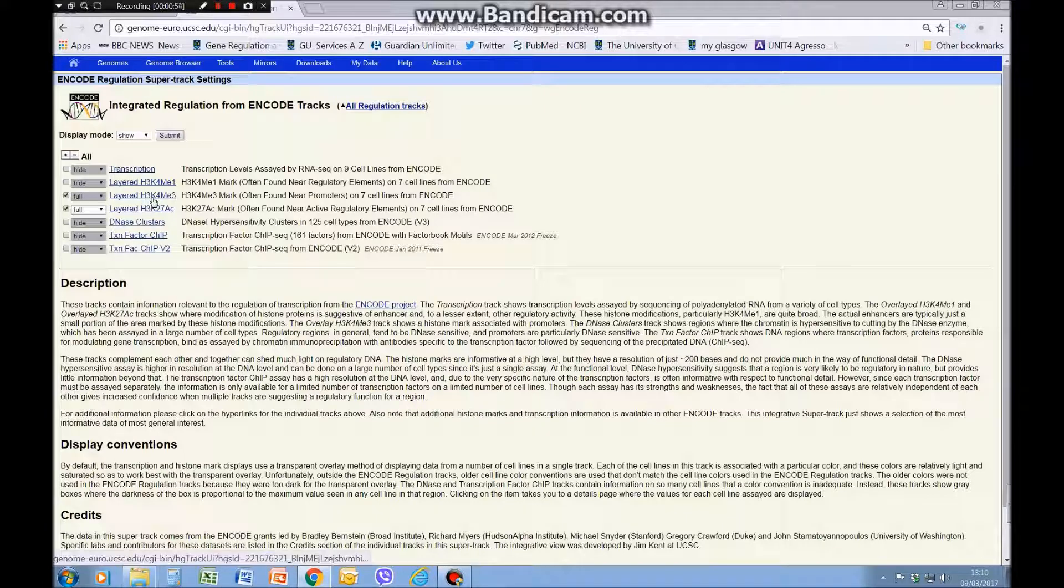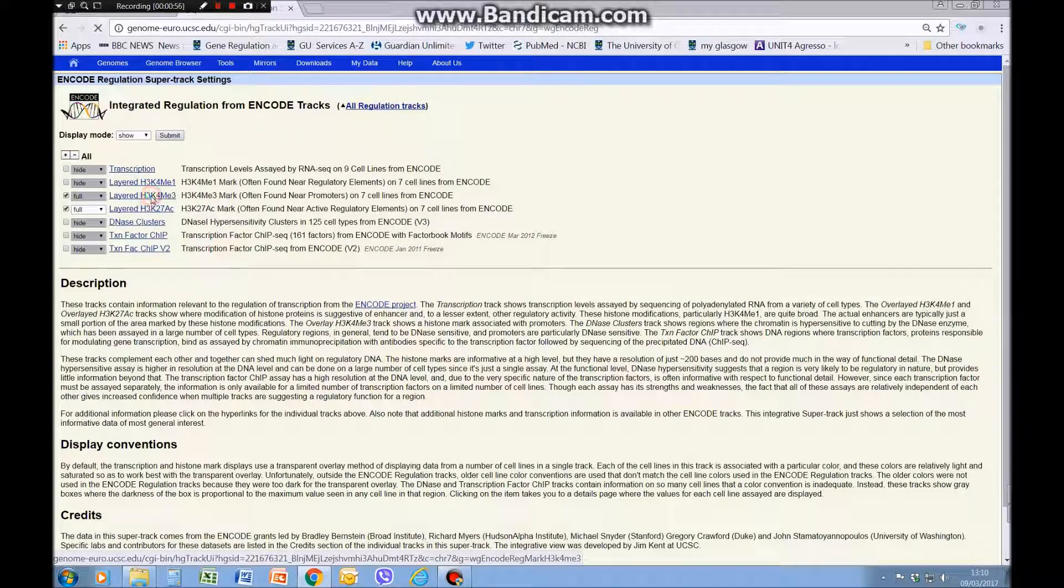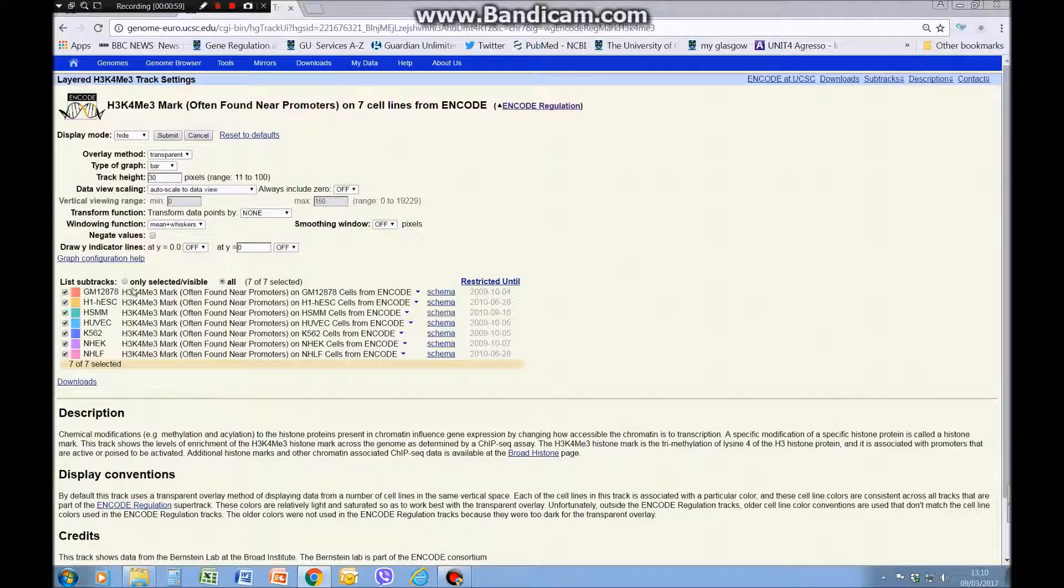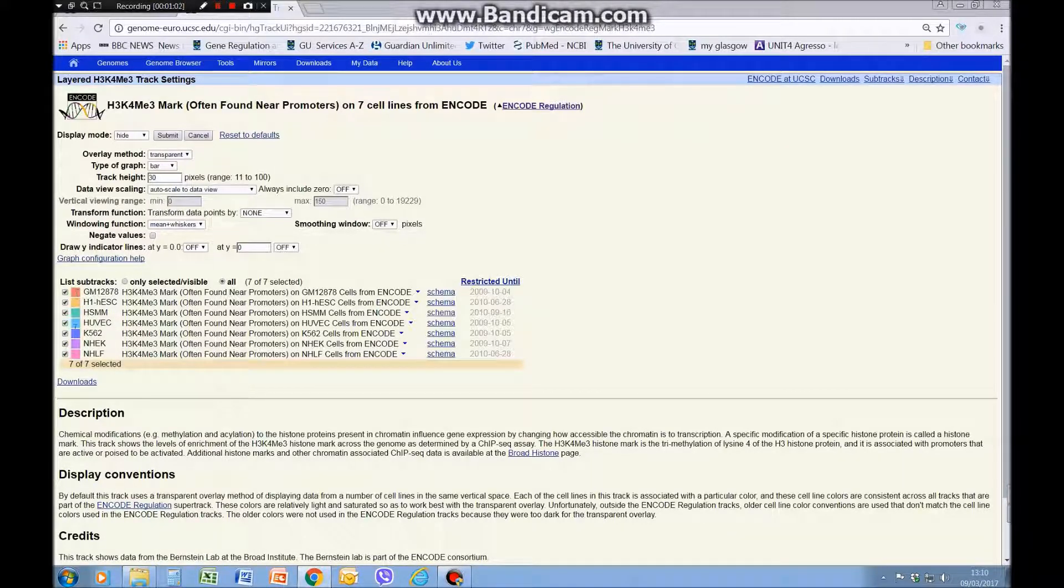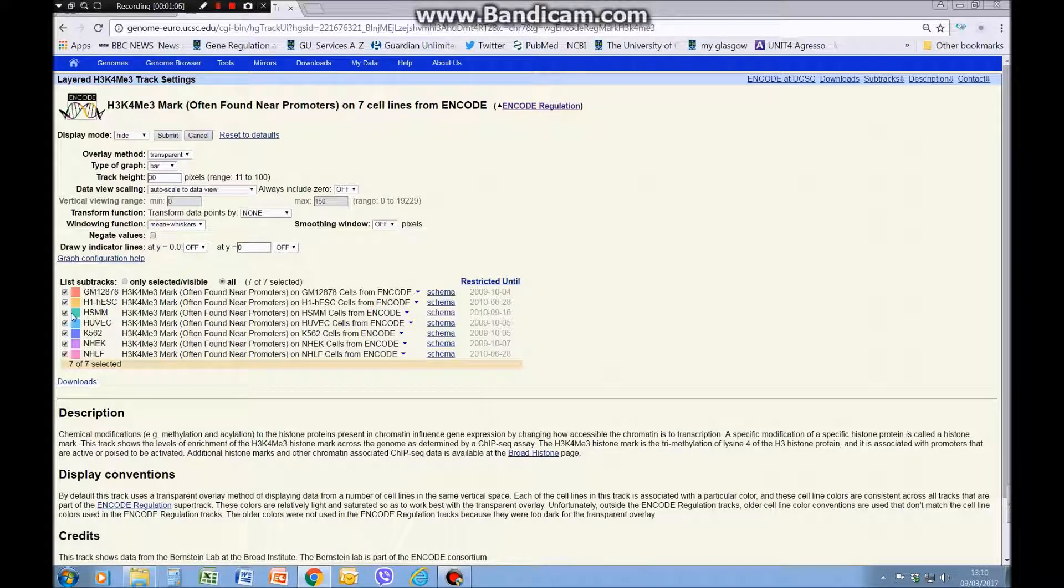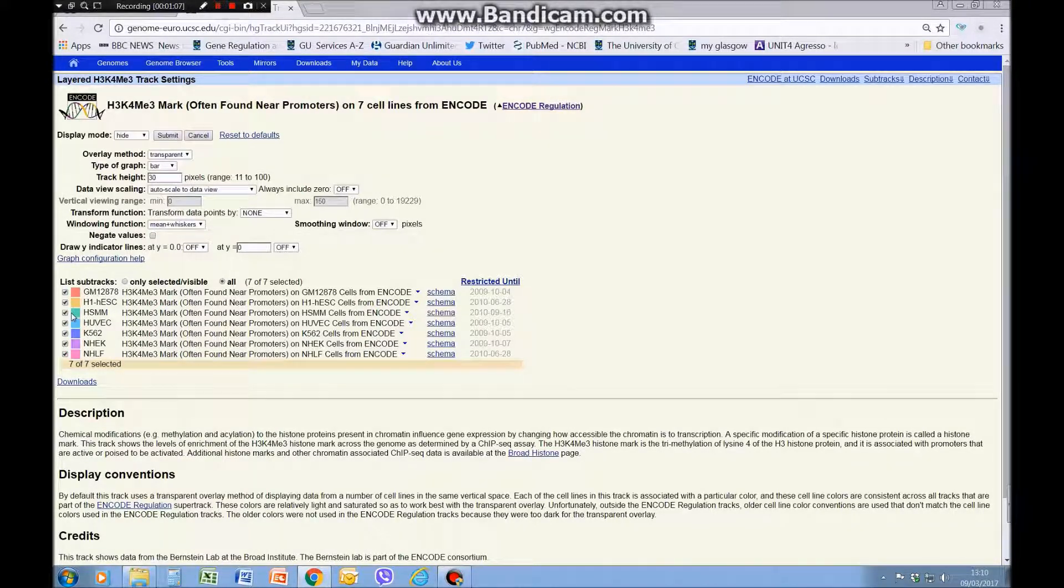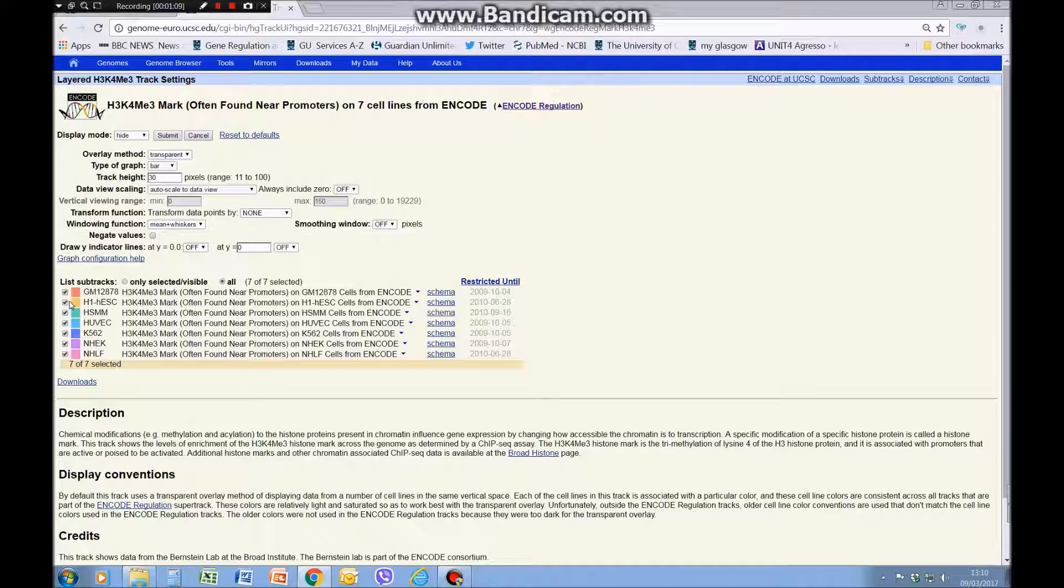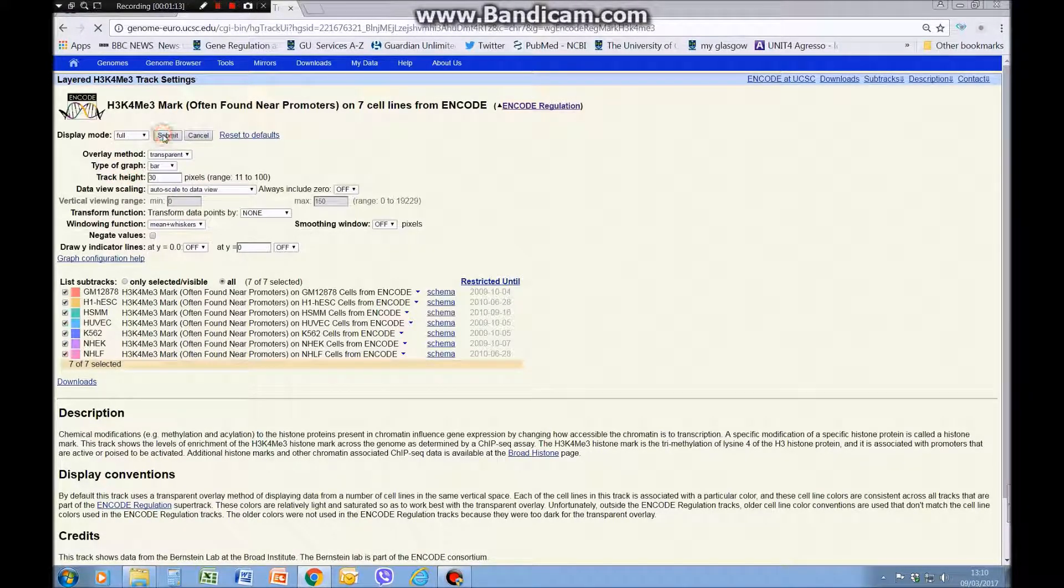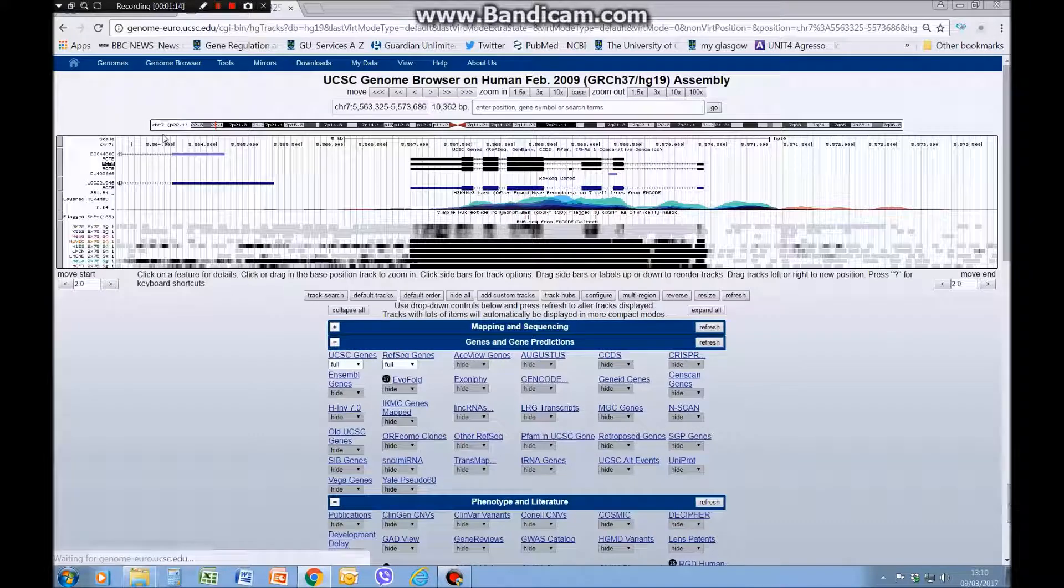You can also click on the links here and that takes you to a list of all the cell lines they've used. We'll just keep them all for now, but if you just wanted to look at one of them, if you knew that one cell line expressed your gene particularly, you can check these boxes on and off. We will set that to full and submit.